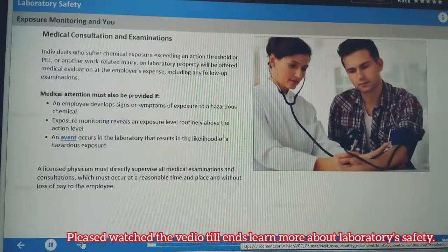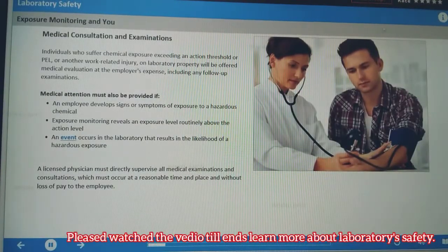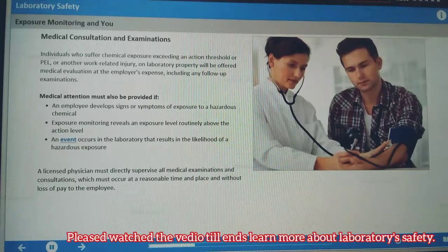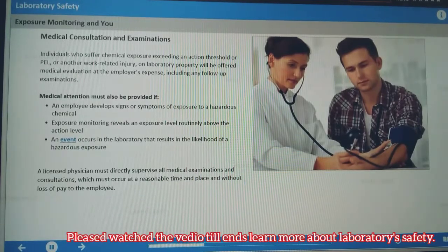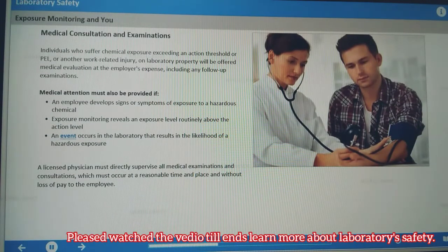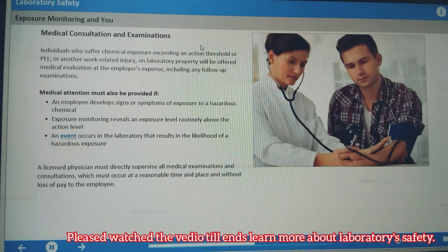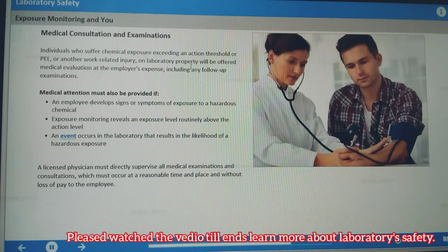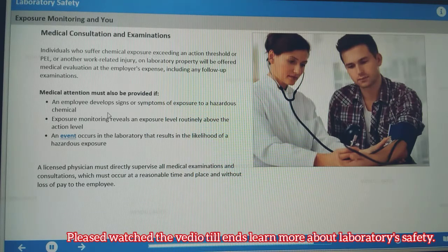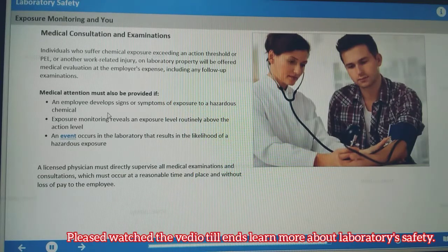If individuals suffer hazardous material exposure exceeding an action threshold or PEL, or another work-related injury, they will be offered medical evaluation at the laboratory's expense, including any follow-up examinations. Employers must also provide medical attention if employees develop signs and symptoms of exposure, if exposure monitoring reveals an exposure level routinely above the action level, or if an event occurs that results in the likelihood of exposure. A licensed physician must directly supervise all medical examinations and consultations, which must occur at a reasonable time and place and without loss of pay to the employee.